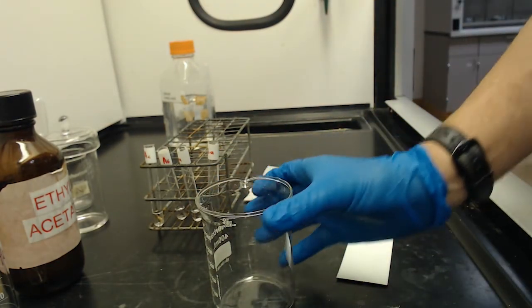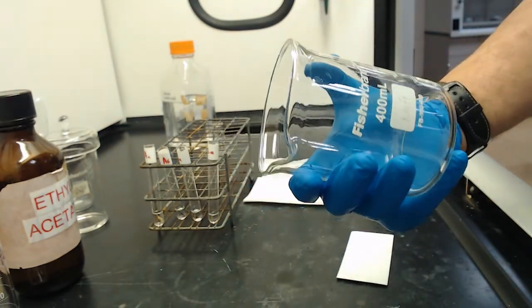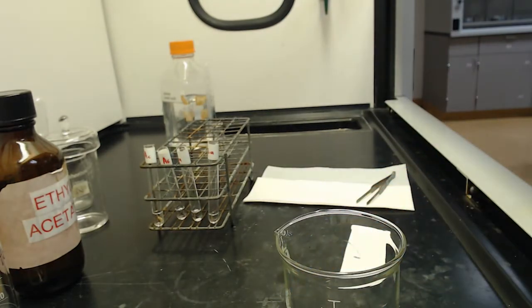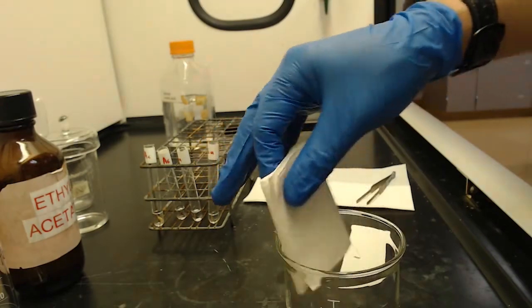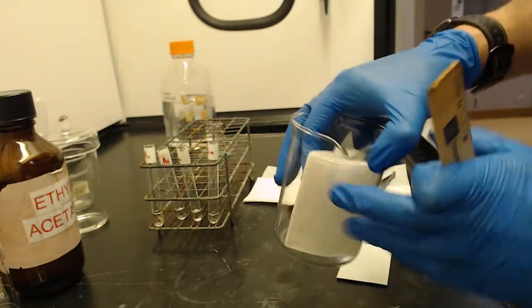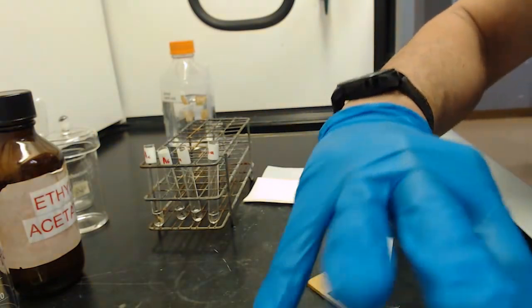The reason why is because the lip on the beaker allows solvent vapors to come out, and your solvent will actually evaporate on the TLC plate. To avoid that, to make sure that you're fully saturated in solvent, you wet a paper towel with your solvent. I recommend propping that in there about where the opening is on the beaker. So I have the solvent from earlier. I'm just going to pour some on here to get it wet.